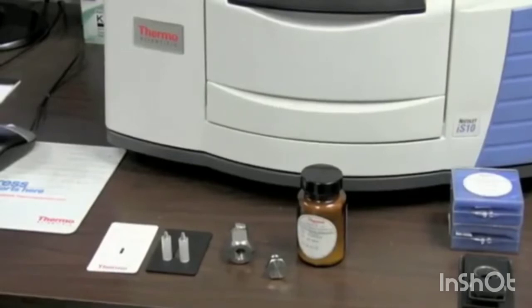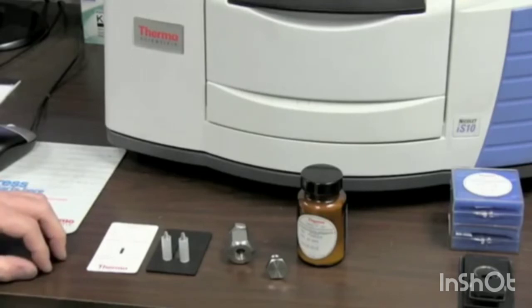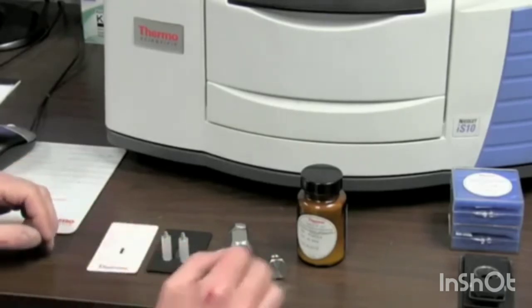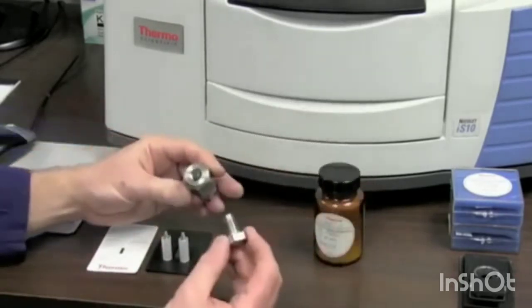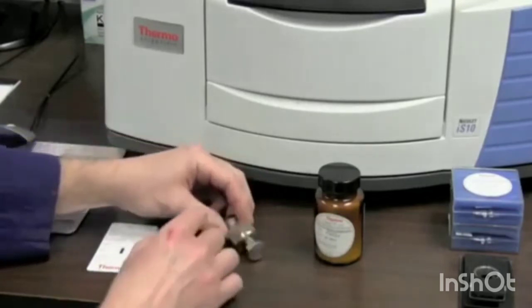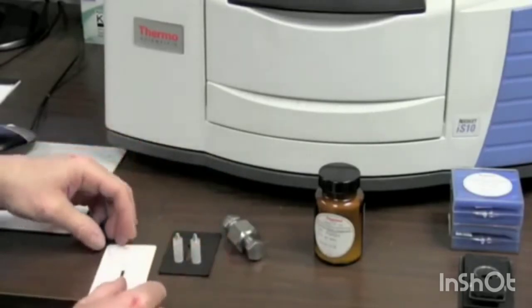FTIR analysis is handy to use for several different types of samples. We can have powdered samples, solid samples, thin film samples, and liquid samples. There's several different ways to get the sample into the FTIR. One is using potassium bromide along with a powdered sample. Screw it together and press it into a pellet, and then we put that pellet on the rack that will go into the light path, and we shine the light directly through there.